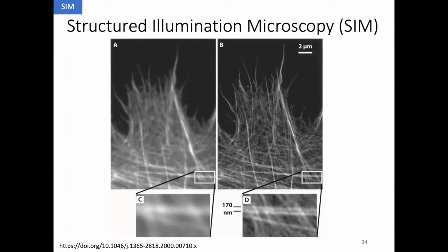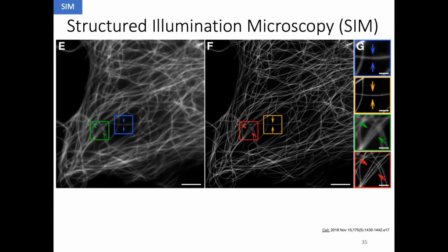If you have questions, please feel free to interrupt. This is another image. So here again, this is normal microscopy. Let's say this is already confocal microscopy. And then this is SIM microscopy. So you see there's a clear improvement in the resolution.